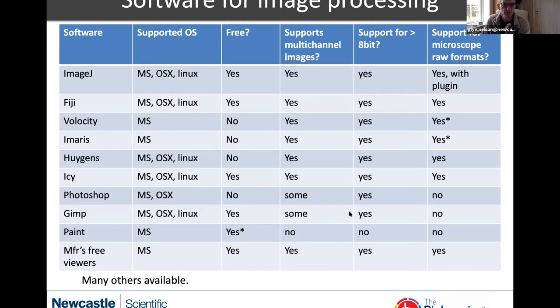But for both of these, multi-channel images don't have great support. And they do have support for 8-bit, for greater than 8-bit depth, but it's not ideal. And they don't support raw microscope formats. They're useful for creating a whole figure, but for actual processing of microscope images, they are not ideal.